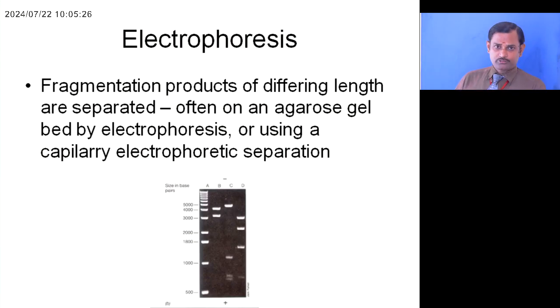For electrophoresis, usually 1% agarose gel is recommended, and with the help of the ladder we can identify whether the particular gene is amplified or not. If the gene is amplified, then you can separate the amplified region from the gel into an isolation buffer, and you can proceed for other purposes like gene sequencing, sequence analysis and further steps.